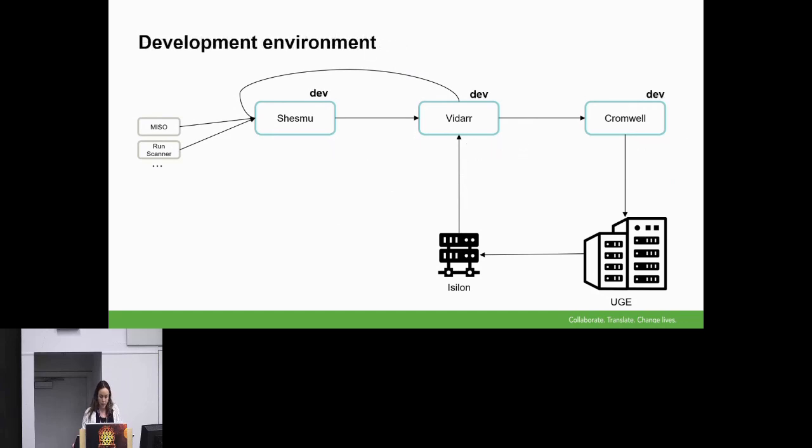Another point I wanted to make is that for each one of those systems, we have a development instance, which are set there to plan and test new features. And we've leveraged this system to develop our pipeline and implement changes and run validations. So this is the environment where we do our validations, and it's identical to our production environment other than the feature we are testing.